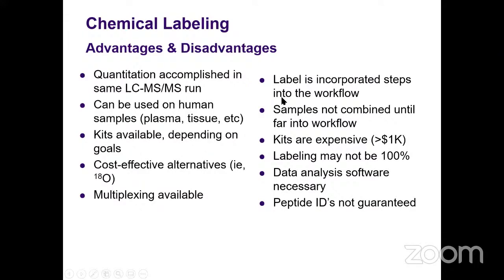So many questions coming in now. Okay. Maybe this one's a quick question. For disulfide or modified cysteine residues, can you still label those?